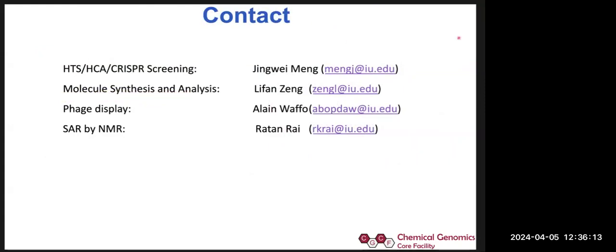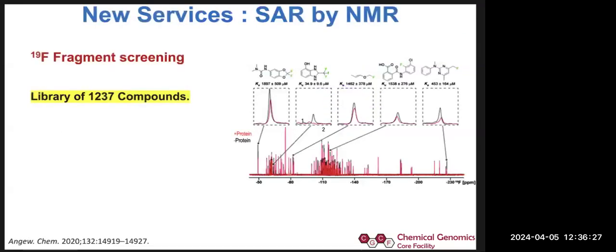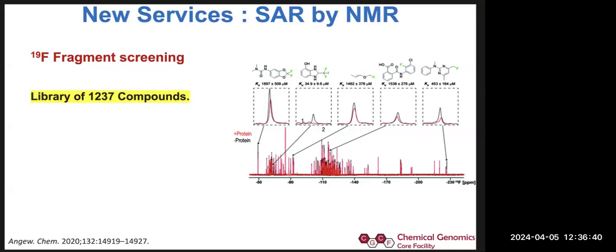I had a couple of questions. The first one is about the last part where you talked about the fluorine marking. I've seen in a couple of different papers where they use a fluorine atom to basically change the electron density of particular molecules. Do you see any sort of effects in that realm when using fluorine-based fragment screenings?